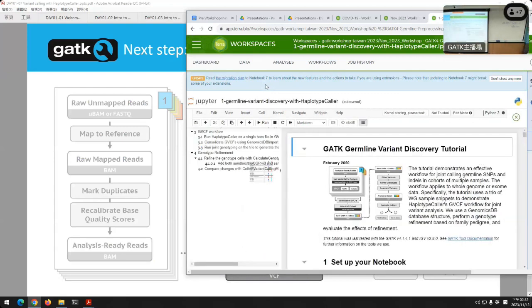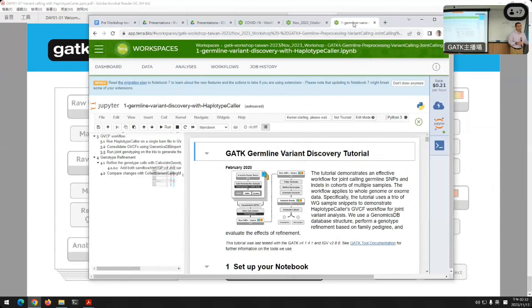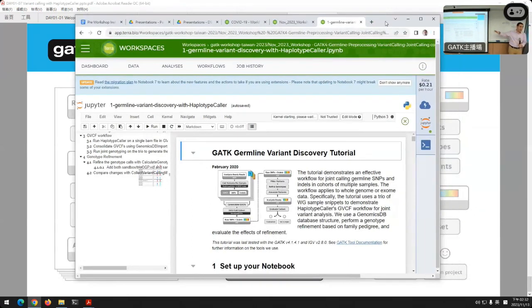Thank you very much. That was a great question. I forgot to mention this as one of my slides. There is a mode to output the haplotypes. It's called -bamout. So we talked about the flags. -R is for the reference, -I is the input. There's also -bamout, and that will let you output the alignments.